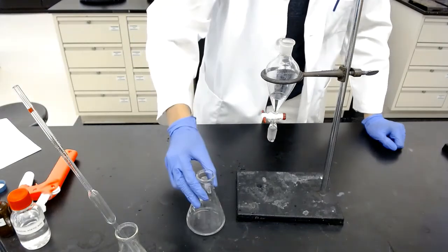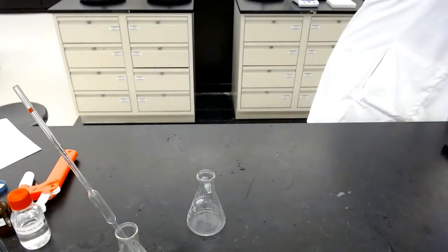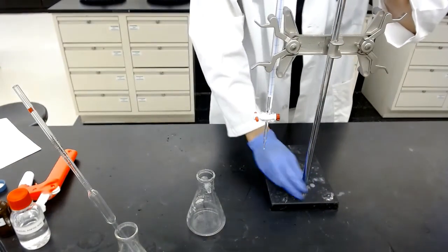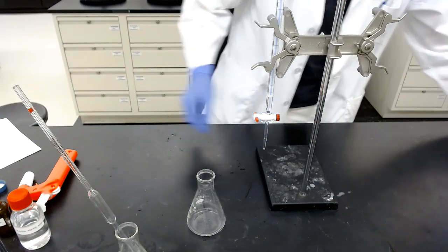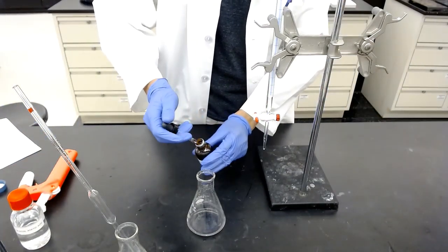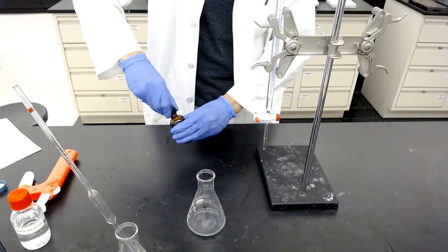We're going to do the second titration. All right. So as usual, you need to add a couple of drops of phenolphthalein. Let's just do 3, just in case.